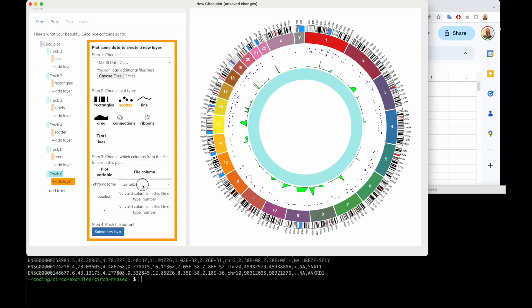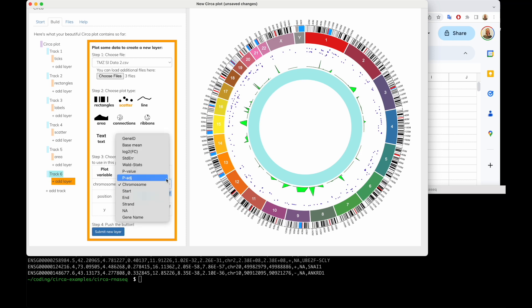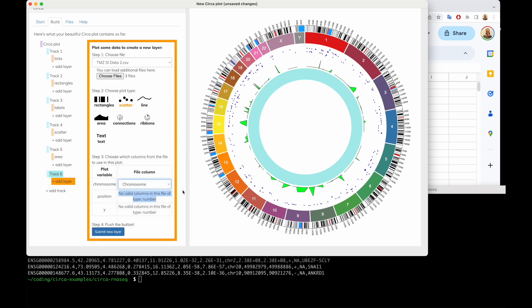Let's say I want to do a scatter plot and I set the chromosome. But it says there are no valid columns in this file of type number. This will only show columns of the data that are the right types. Chromosome is a string — it can be any text. But for position and Y-value, they have to be numbers. So we need to go and take a look at our file.